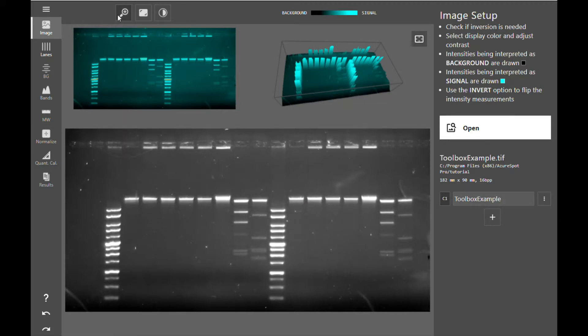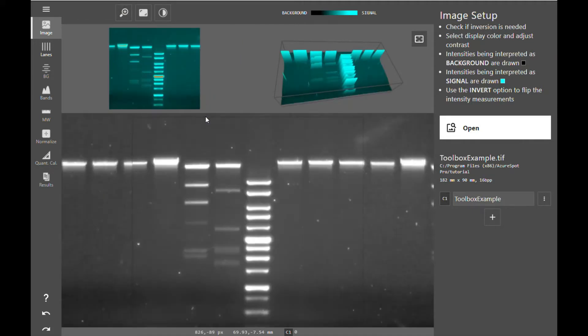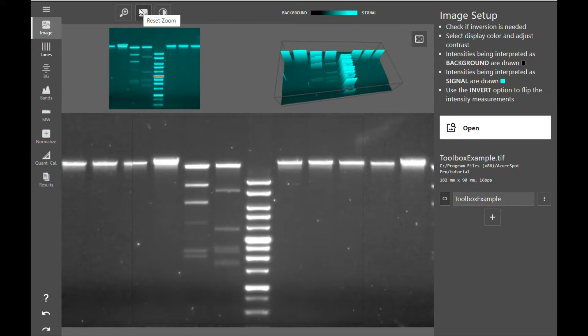You can zoom in on any section of your image by clicking the Zoom button and clicking and dragging to highlight a specific section that you'd like to view. You can revert back to the original image by pressing the Reset Zoom button.